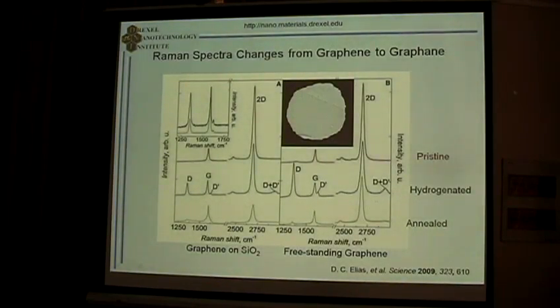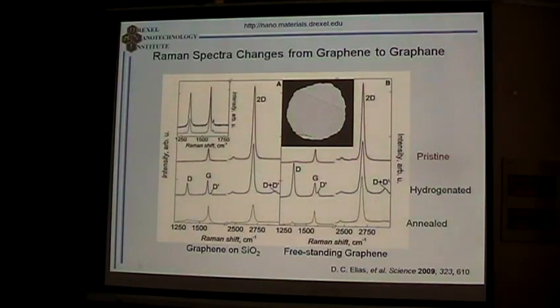Moreover, this is also a good example to show how chemistry changes will affect the Raman spectrum and how Raman spectroscopy can be used to monitor those. If you put graphene in hydrogen plasma, you can add hydrogen atoms to graphene, making it hydrogenated, producing something which is called graphane. So this is a hydrogenated layer of graphite. It's an insulator, not a zero band gap semiconductor any longer.